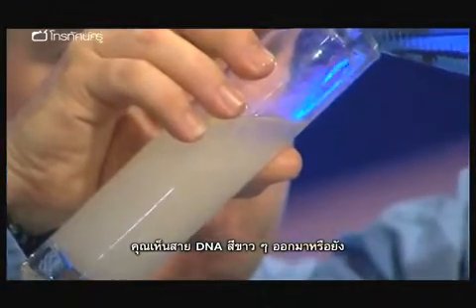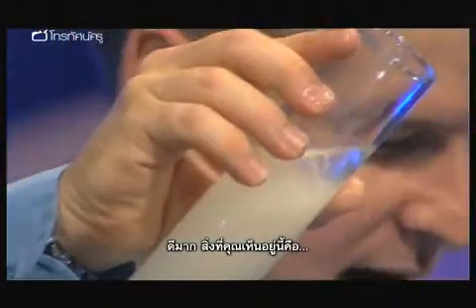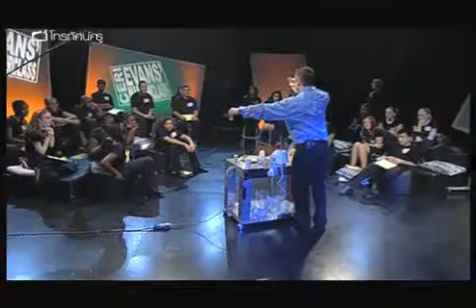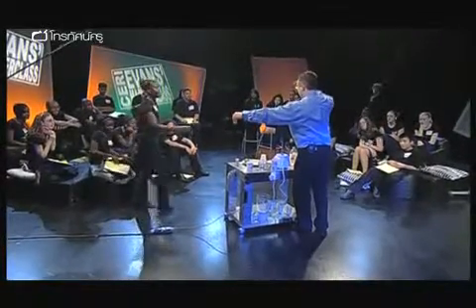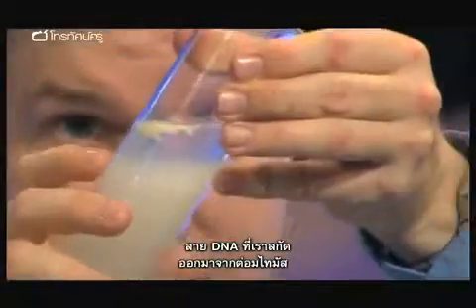Can you see any strands coming yet? Yeah. Can you? Look at that. All right, fantastic. Eugenia, can you get me a cocktail stick out of there for me, please, very quickly? Look at that. Can you see it? That is actually real DNA, which has been extracted from these thymus glands.